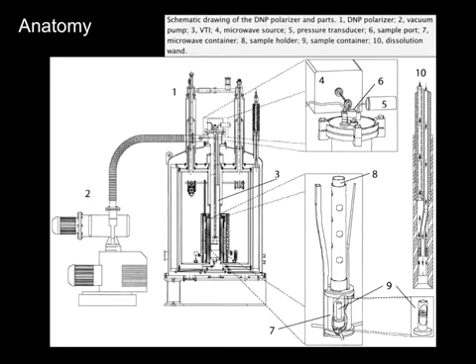So the real critical part, I think, is this VTI, which is part 3, which is this insert that sits inside the bore of the magnet. This is the part which forms a sealed enclosure inside the magnet, which lets the bore of the system reach very low temperature, and it does this by filling this insert with liquid helium.